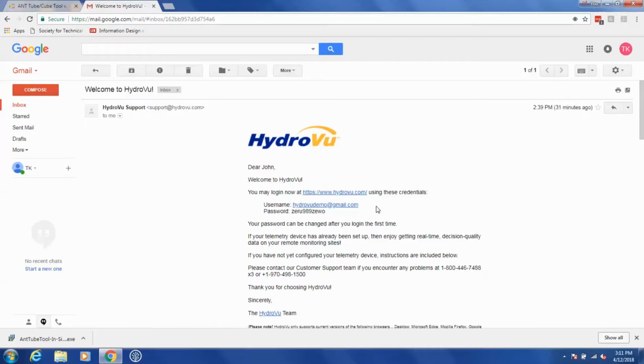The first thing you need to do is log into your HydroVu account. If you are the administrator, you should have received a Welcome to HydroVu email from support@hydrovu.com. Please search your spam or quarantine folder if you can't find it. Contact our helpful support team if the email is nowhere to be found.